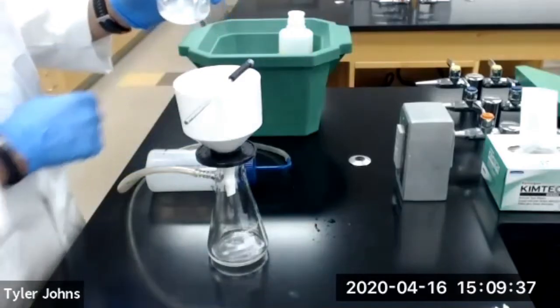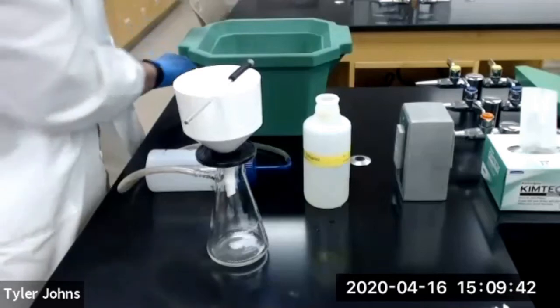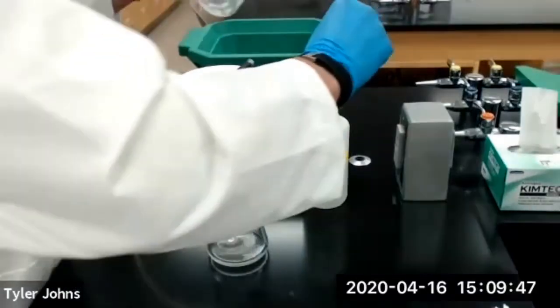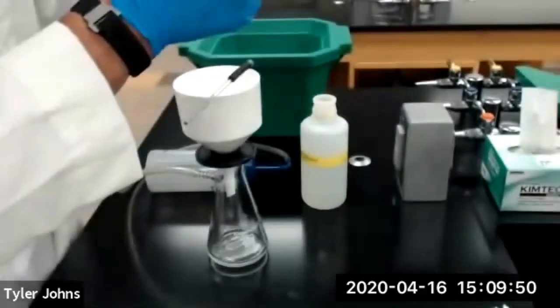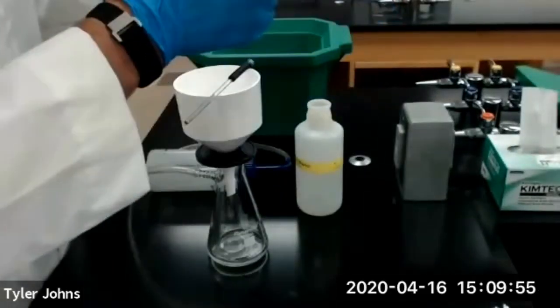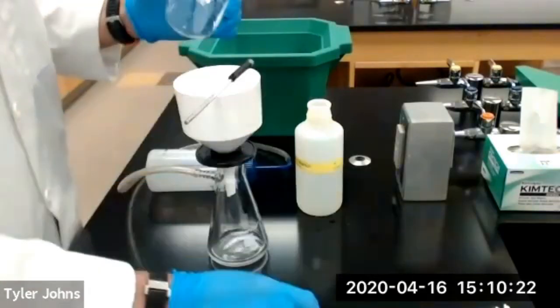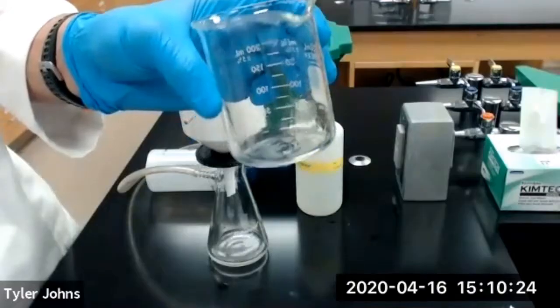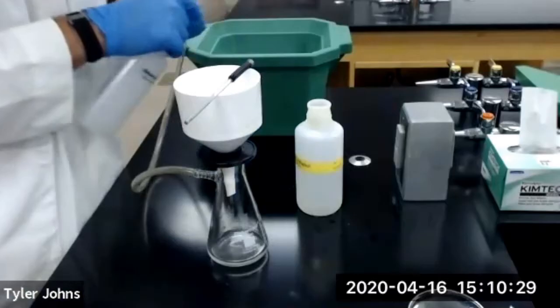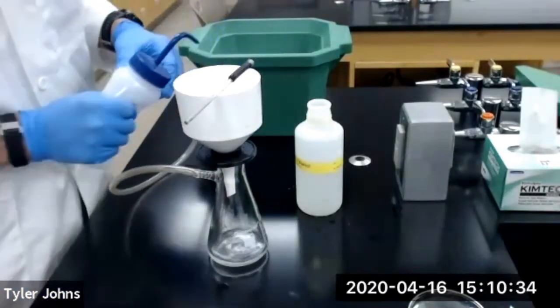And I'm going to use some 95% ethanol to help me get the rest of the alum from the beaker into the Buchner funnel. Okay, so we've transferred our alum from the beaker into the Buchner funnel. And now we'll continue to pull a vacuum through to filter.